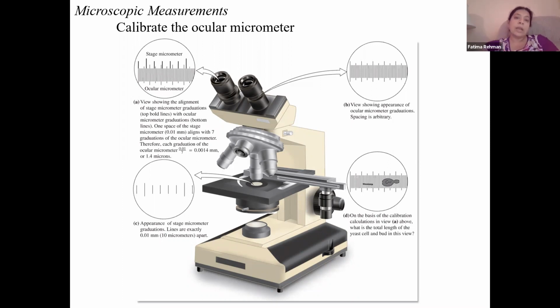So that is good. Now, these lenses themselves magnify your image anywhere from 5 to 20 fold, and that's important in figuring out your final magnification of images when you're looking at them under the compound microscope. The ones that we use in the lab are 10x, so that's the one we are going to be looking at. All the measurements that I give you, we are going to assume that the ocular lenses are 10x magnification, and that's what they have.